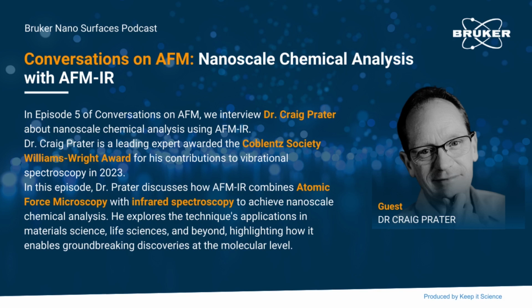And like you say, unfortunately, not everyone has one, as much as we wish that we had. And so obviously AFM-IR solves a lot of these problems, right, that you say. It's probably also a little bit more applicable to samples in terms of it's non-destructive as maybe other systems. The other key thing that AFM-IR solves is the spatial resolution of conventional infrared spectroscopy.